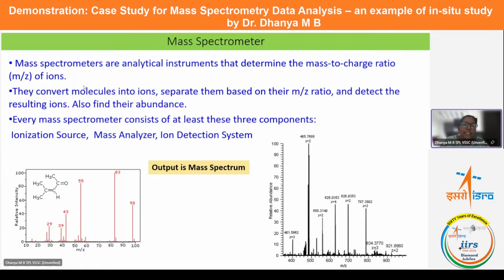That is what is written here. They get converted to ions because any technique involves separating them based on electric field. Most of the techniques we use cannot directly deal with the neutral gas, molecules or atoms. We need to control them by applying electric or magnetic field. For an atom or a molecule to respond to electric or magnetic field, they have to be ions. They have to have charge. That's why we ionize them.